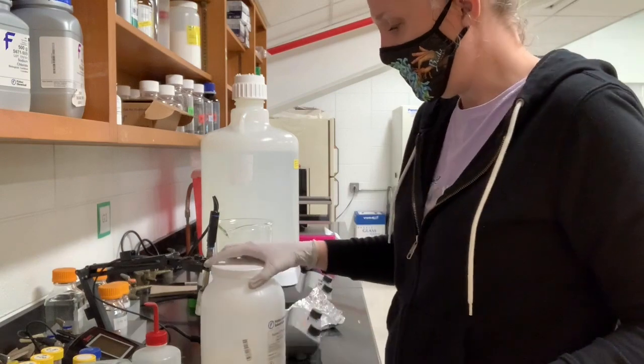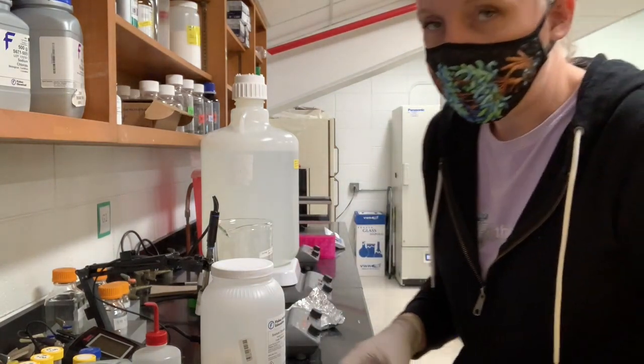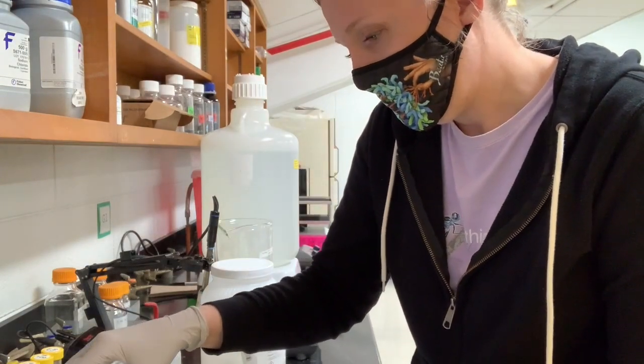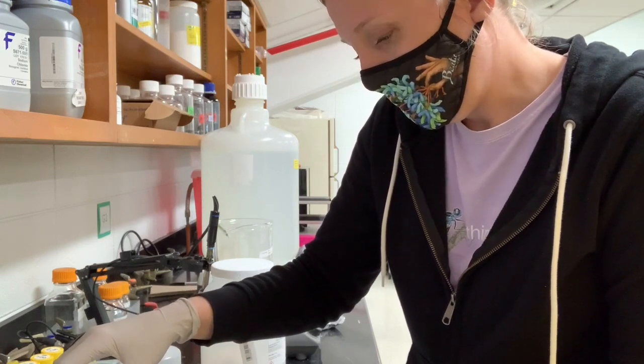I like for solutions to be pretty precise, so if I go a little bit over, I will take a little spatula and remove a little of the salts until I get right to the amount that I wanted.